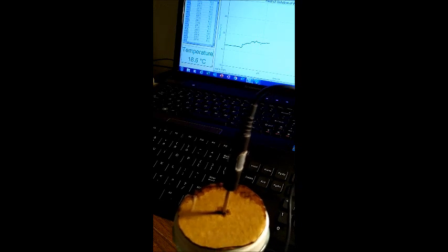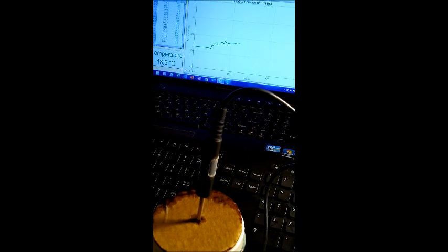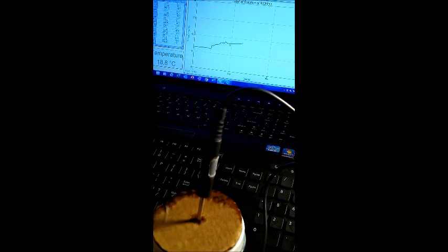I'll gently swirl it. Part of the problem is I'm using KOH that has been in our stock room for probably almost 3 years, so it's absorbed a lot of CO2 from the air. So it isn't the best, and you can see some of it actually stuck to the pan. It absorbed moisture in my somewhat kind of damp basement. So this isn't a great trial, but I think it's accomplishing what I want you to see.